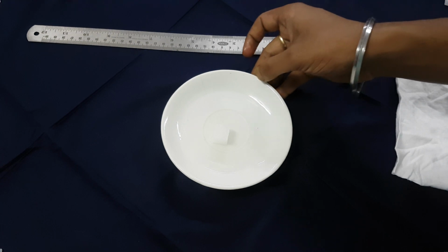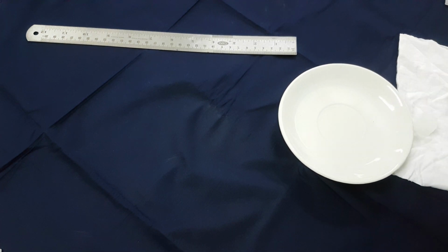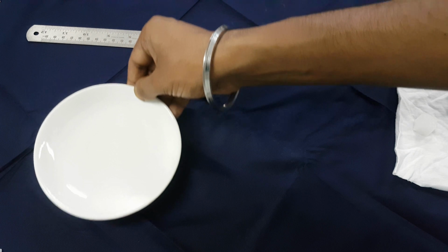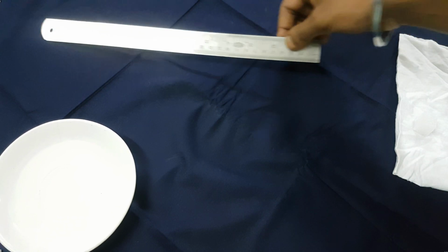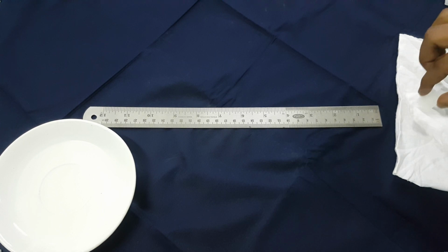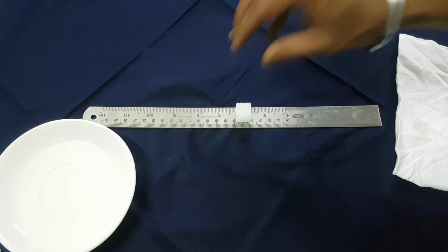So what I was planning is to do like this, bring it here, pick it up like this, bring it here. Okay, let it absorb and keep it, let's say, half in there. Next bring this front here, and after it's nearly absorbed, let's keep it here between 14 and 16.